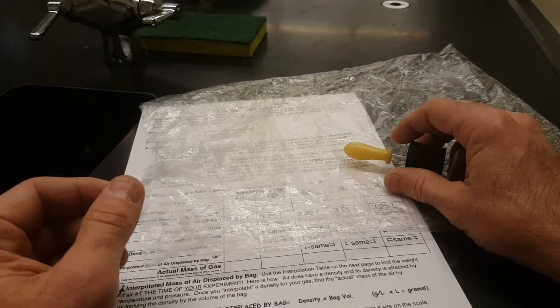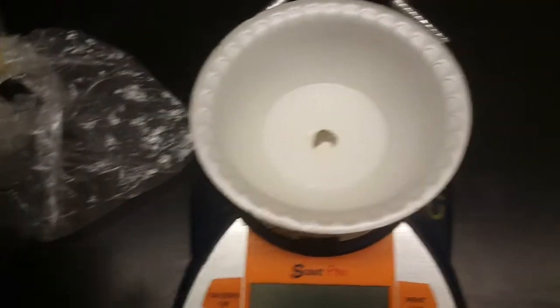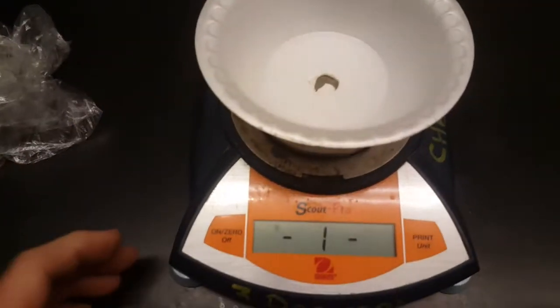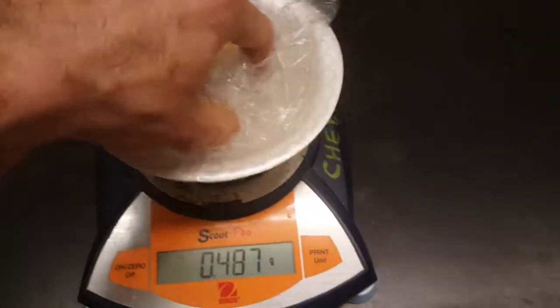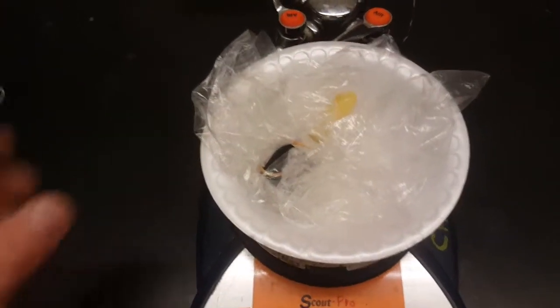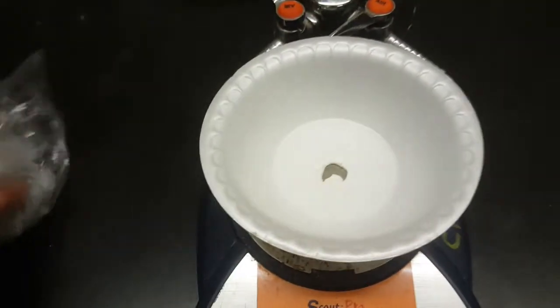The first thing you've got to do is weigh the rubber band and the stopper and the bag and everything. So you're going to come over to your scale, and the reason there's a bowl on your scale is to keep everything from rolling off, keep things confined. Make sure that your scale is zeroed with the bowl on there first, and find the mass of all of your stuff. Write that mass down on your lab paper. I'm deliberately not showing you my mass, so you won't write my mass down. Write your own mass down.